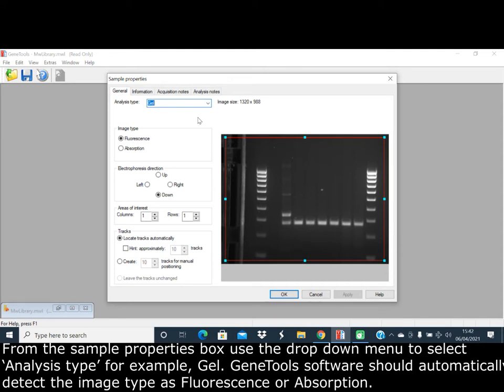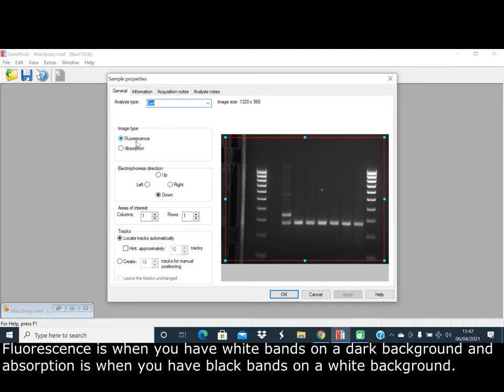GeneTools software should automatically detect the image type as fluorescence or absorption. Fluorescence is when you have white bands and a dark background, and absorption is when you have black bands and a white background.